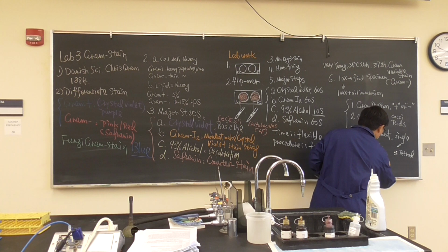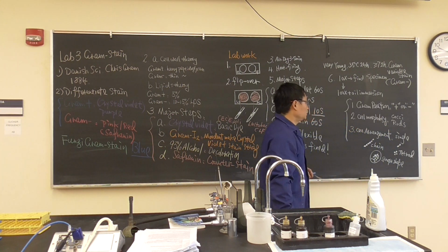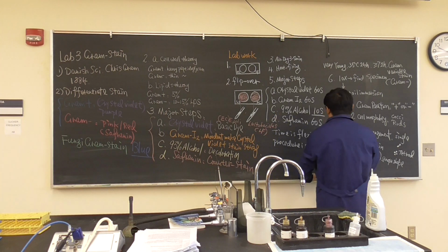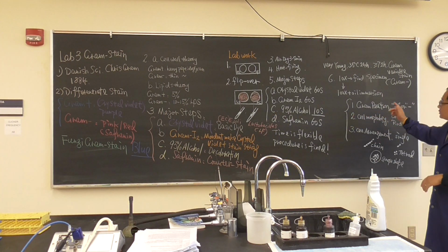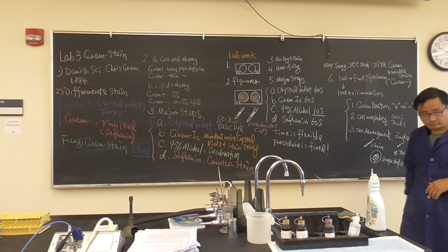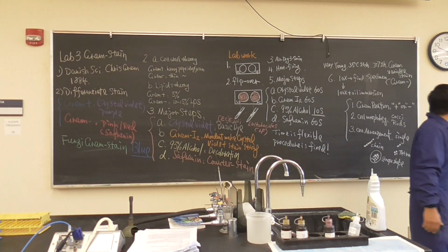We call it a grape shape. So these are called cell arrangement. These we have to record. Lots of you will remember gram reaction, positive and negative, but the others you may forget. Okay? So this is what I have for the opening remarks.